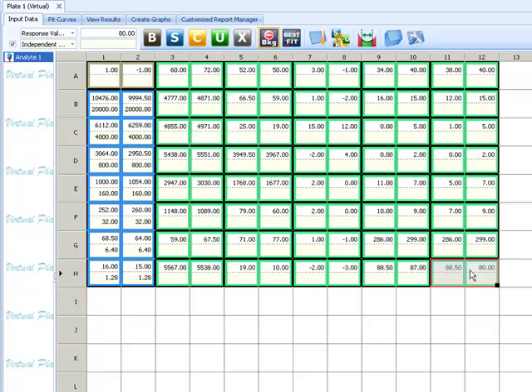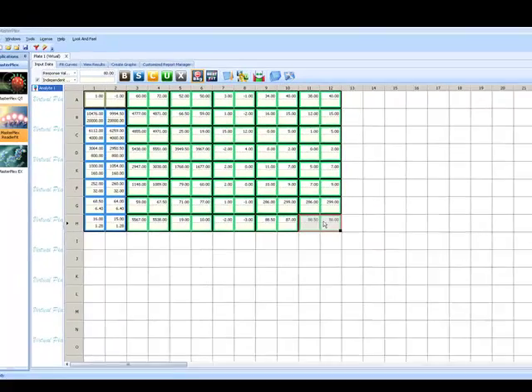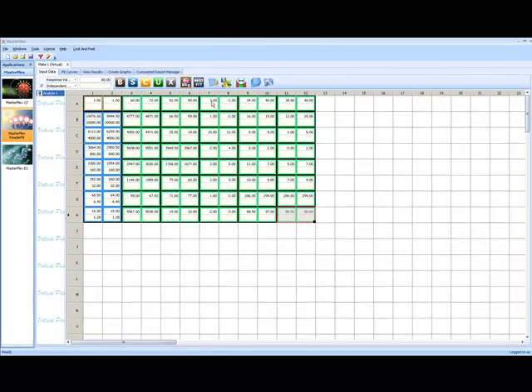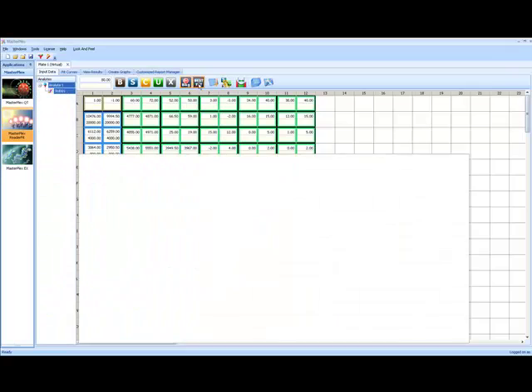When I am done, I simply press the Best Fit button and ReaderFit will automatically choose the best curve fit for me.